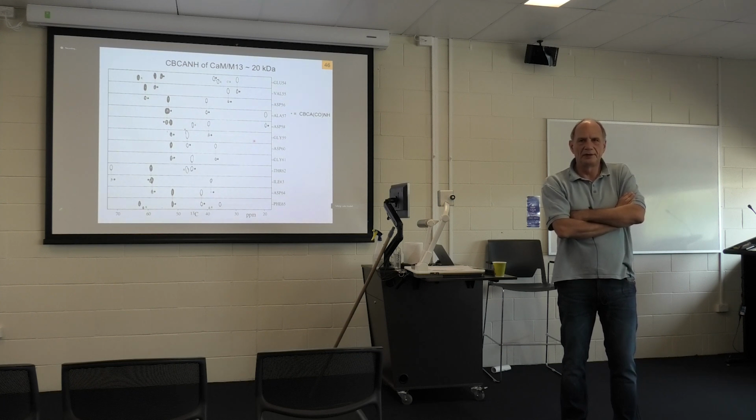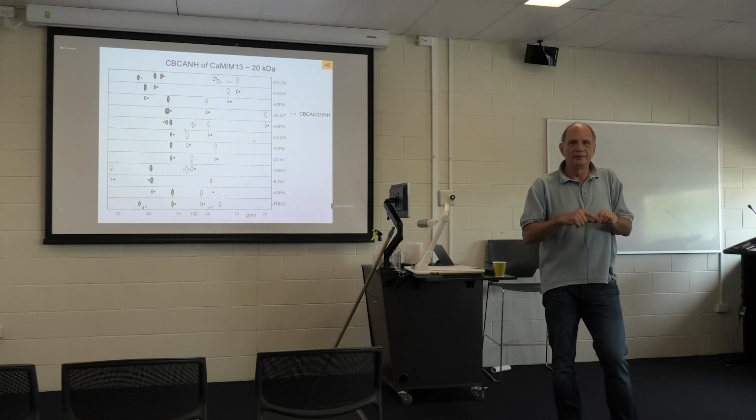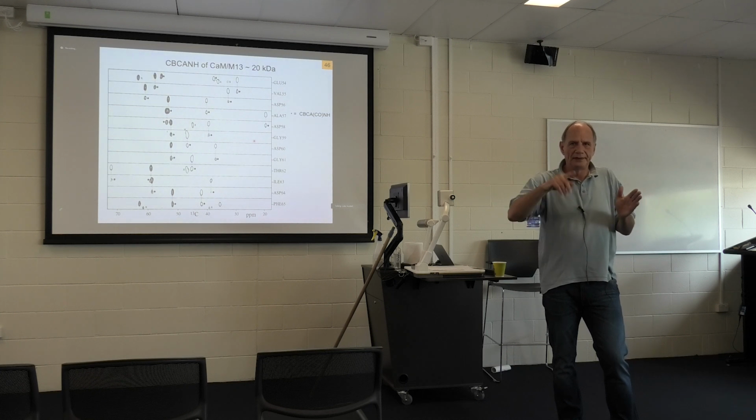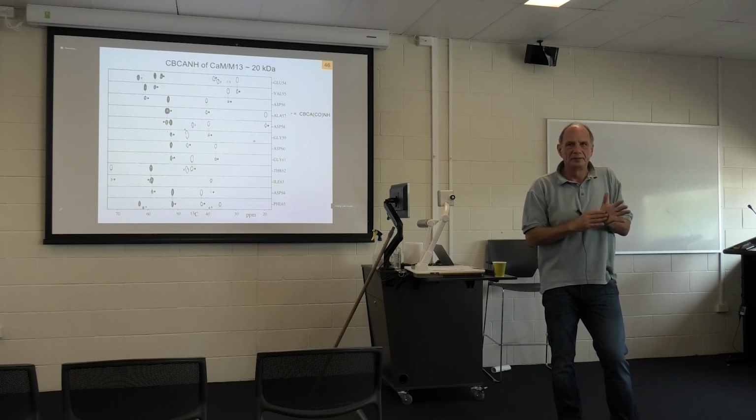The distance from C-alpha to CO is 120 ppm or so. I guess what you're talking about, to some extent, is that you excite C-alpha and may excite at the same time CO, because your rectangular pulse has an excitation profile with some wiggles in this region, but they are weak. The other question is whether you could decouple C-alpha from C-beta with some tricks, but this is difficult because the serine and threonine are close by, and then the alanine and so on.